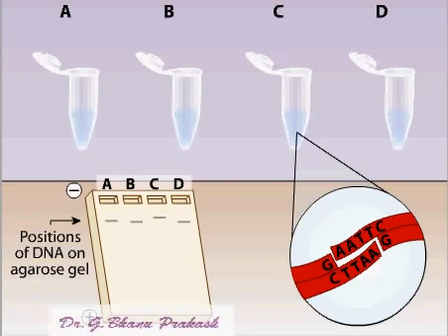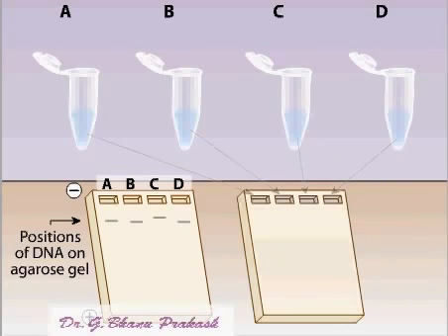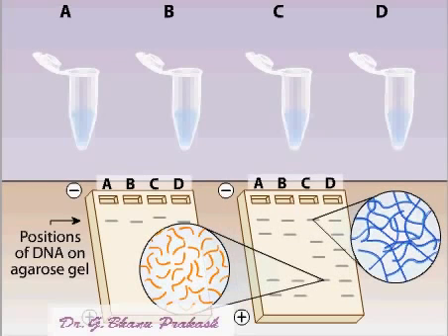The type of plasmids in this particular sample can be cut in 4 places with EcoR1, producing 4 fragments of different sizes, represented here as different colors. When the fragments are loaded on a gel and electrophoresed, the fragments separate from each other. The slower bands on the gel contain larger fragments and the faster bands contain smaller fragments.